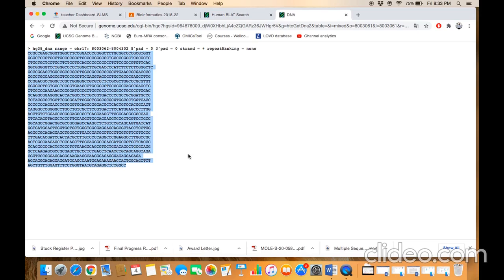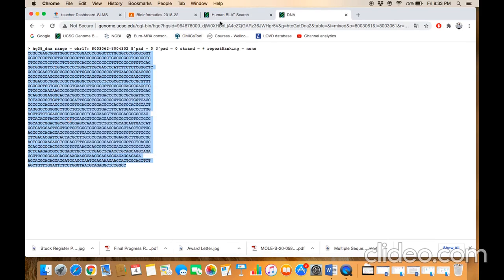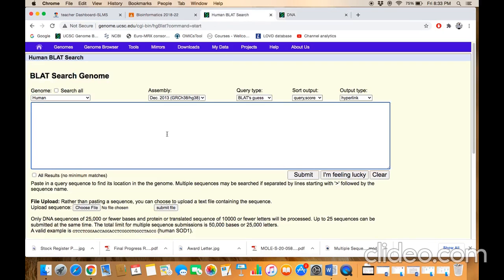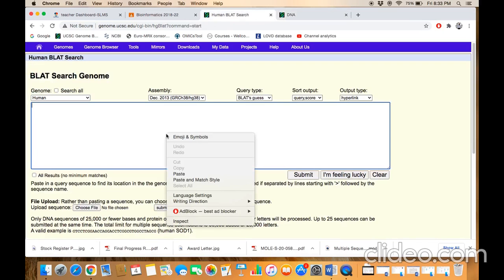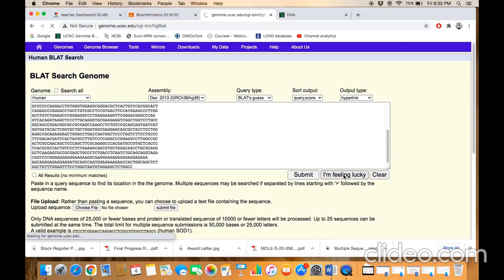We need to copy this sequence and paste it here in the query box, and just click on 'I'm Feeling Lucky.'